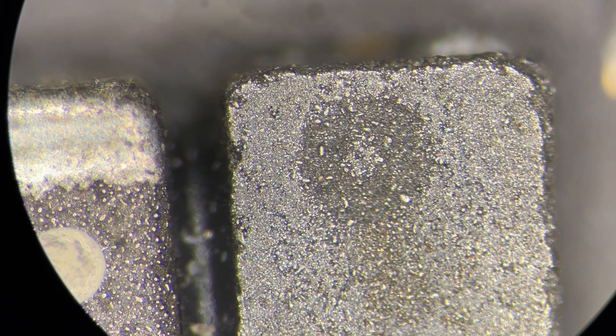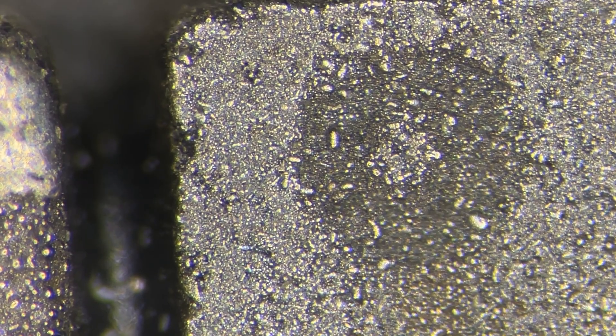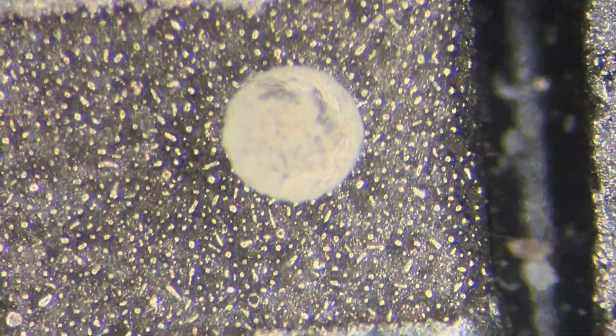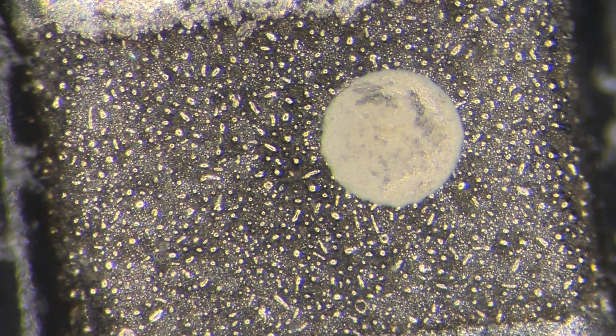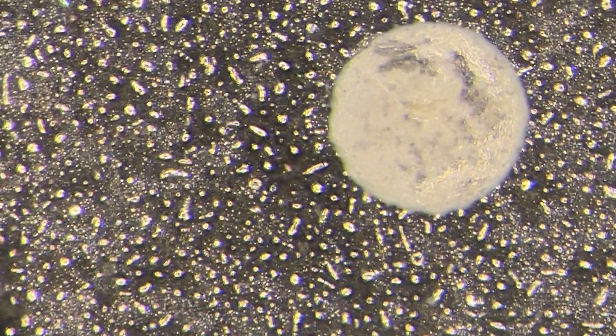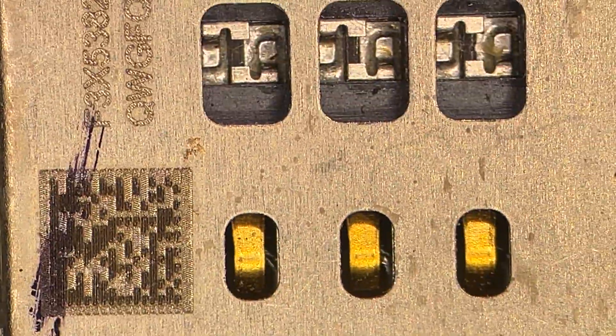To see real resolution we need to get a little more magnification from the phone. Only then can we reach to the edge of the diffraction resolution of the microscope itself. We can even move a bit further in resolution here, and let's walk over the board.